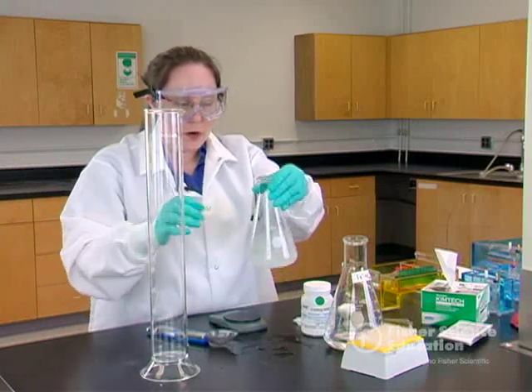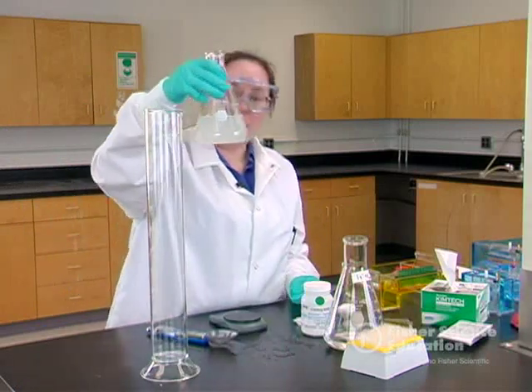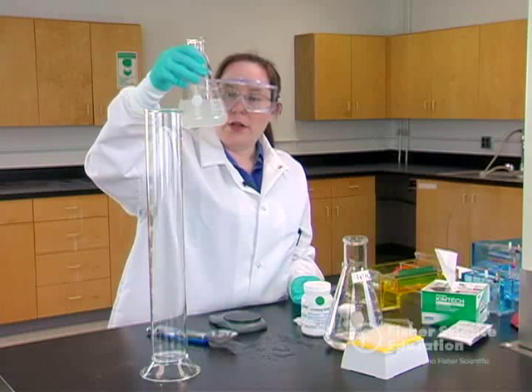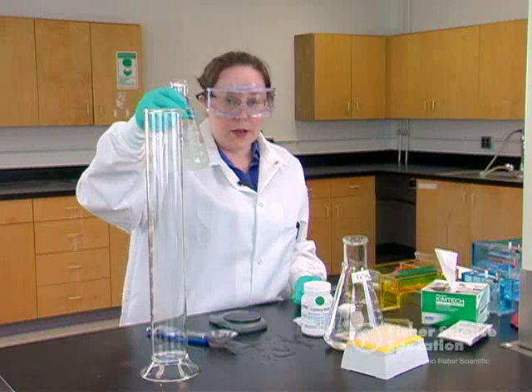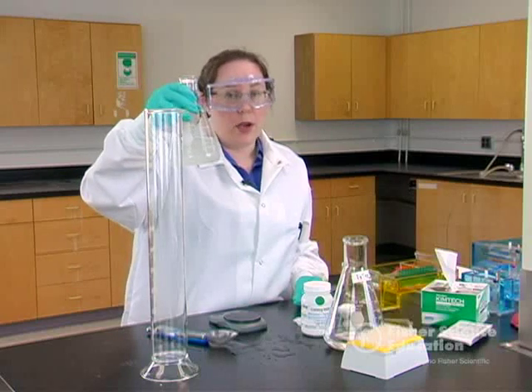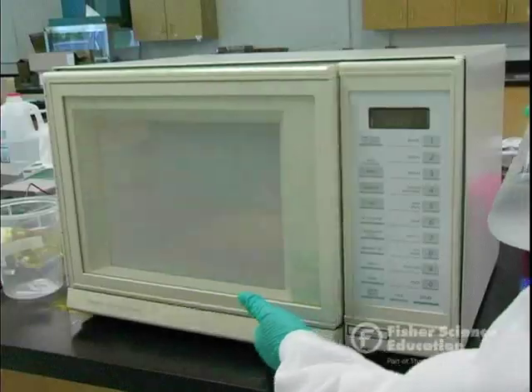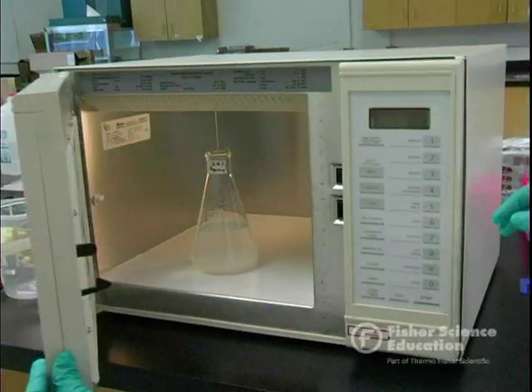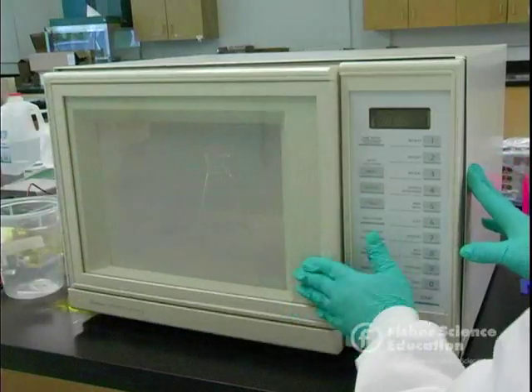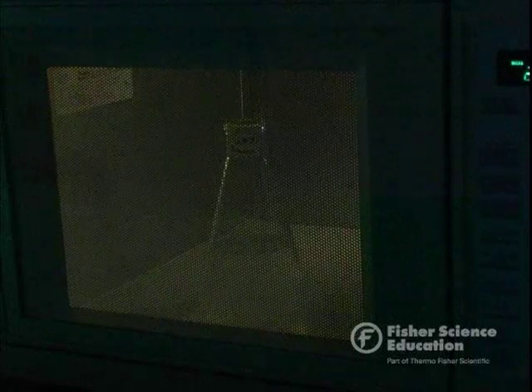You can see when you first start, agarose is going to look very opaque — kind of like watered-down milk. We're going to go ahead and microwave this until it's completely clear. When it's all finished it should look just like water. Right now it's opaque, so we need to melt it in the microwave until it's clear.